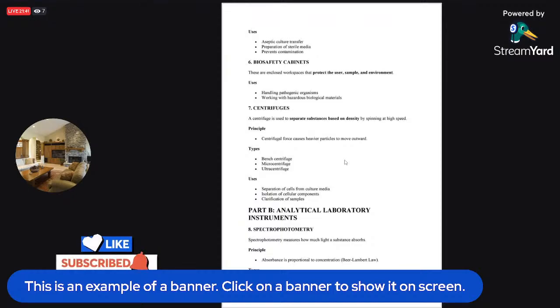Biosafety cabinet, depending on the organism, the virulence of the organism you are actually working with. There are some organisms that are maintained at BSL 1, BSL 2, and biosafety cabinets like that. So you need to maintain that. It's going to protect you as the user, it's going to protect the sample as well as the environment. It is used in handling pathogenic organisms, then working with hazardous biological materials.